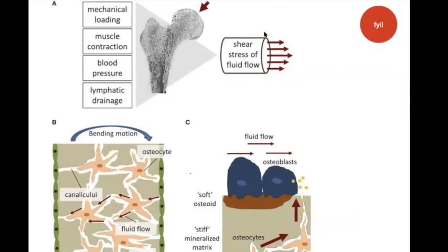I want to point out while we're here, and we'll get back to this, here's the osteocytes, right? They're connecting with each other through these canaliculi, and those canaliculi have some kind of interstitial fluid that's floating the cells and traveling through them. When your bone is facing some kind of mechanical load in one way or another, that's going to cause the fluid to run in a particular direction based on that movement. And the osteocytes, I said they're dynamic, right? They're detecting that movement over here.